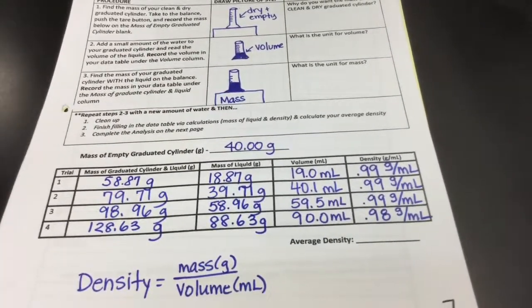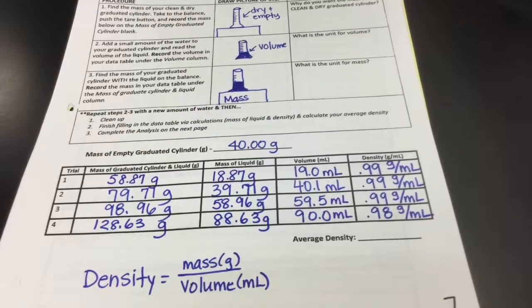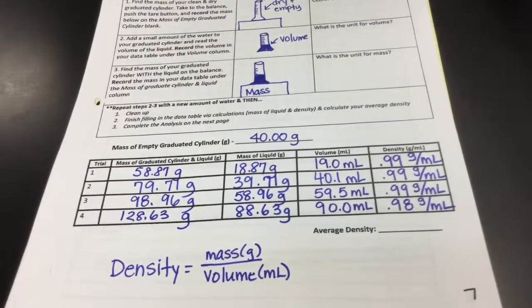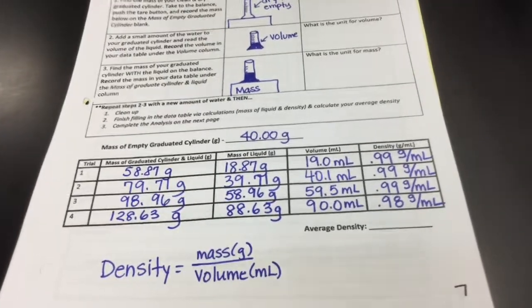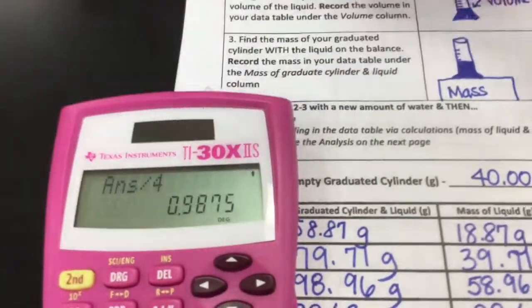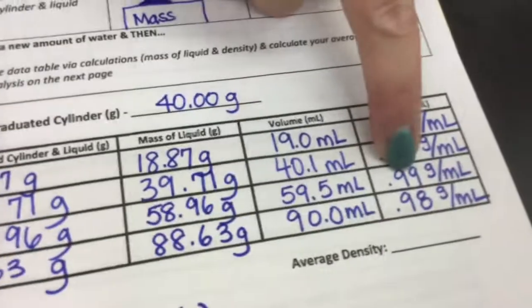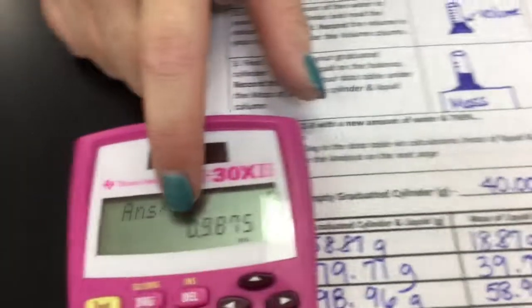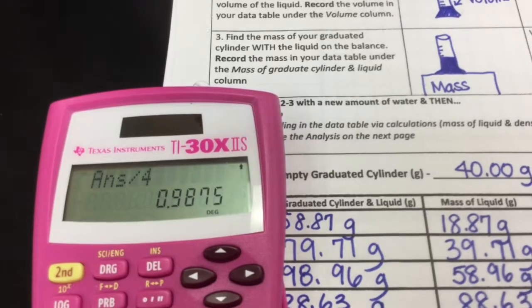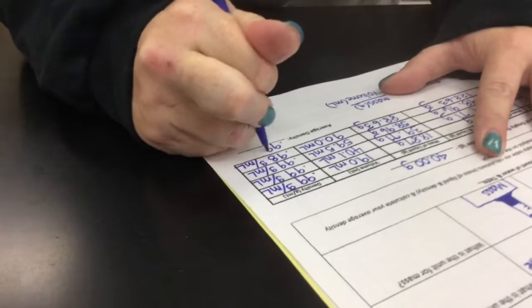And why do we want to find the average? Because when we're doing our labs and we're doing measurements, by finding our average, it allows us to be a little bit more accurate. All right, so here is my average. You may have guessed, because I have three 0.99s and one 0.98, that it's going to round to 0.99. So 0.987 rounds up to 0.99 grams per milliliter. So that's the average density of our water.